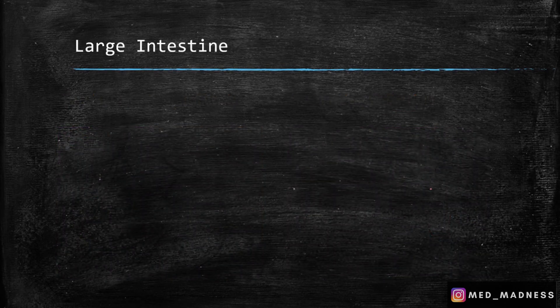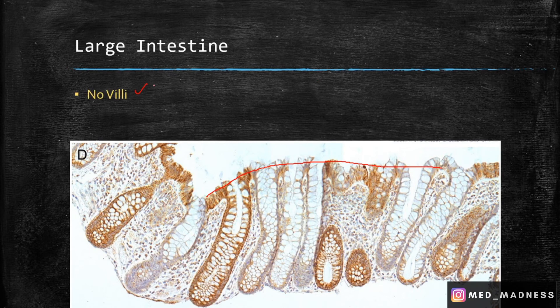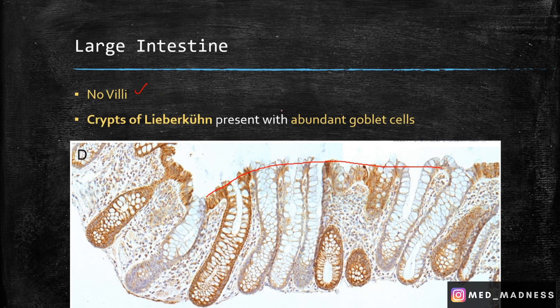Now the large intestine — some important features. How can you tell this is the large intestine? First, there is no villi; this is the most distinct feature of the large intestine. Number two: the crypts of Lieberkühn are present with abundant goblet cells. You can see the crypts of Lieberkühn here with abundant goblet cells — more in number when compared with the small intestine or the stomach.